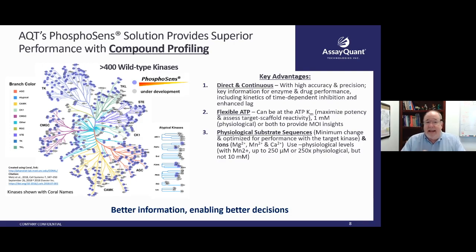And we're also debating exactly what the format will be. Is it just going to be 4 of the 384 well plates that we use right now? And we're happy to provide detailed information on all of this for anybody who's interested. Or are we going to take advantage of this and get still more information on those 1536 well plates? That's all up in the air. No promises, and I'm sure somebody is throwing popcorn at me right now for saying that we might be able to get this done by the fall.